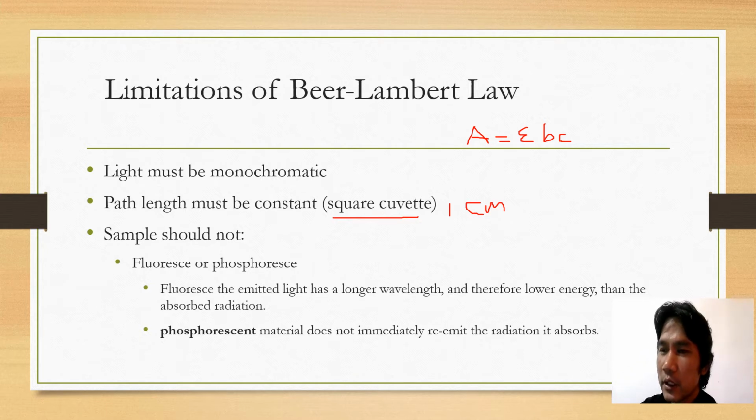Remember, the purpose of the prism is to select the light that depends on the wavelength of interest, and that is the light that would pass through the slit.